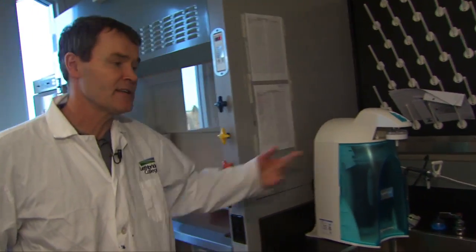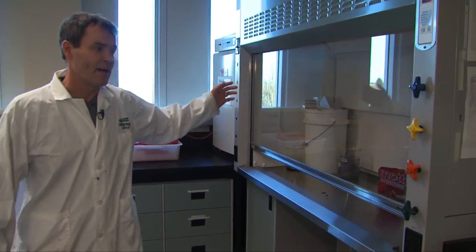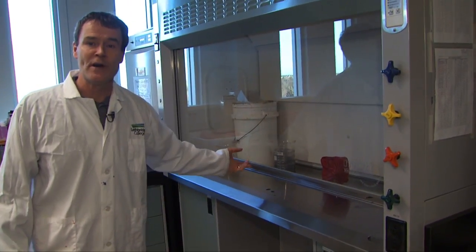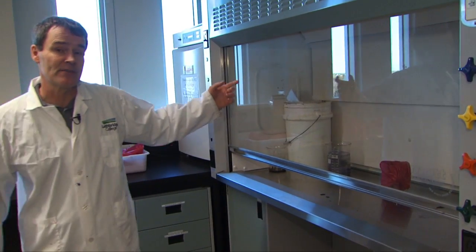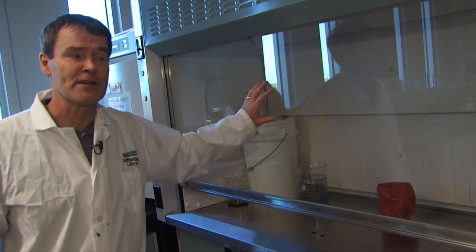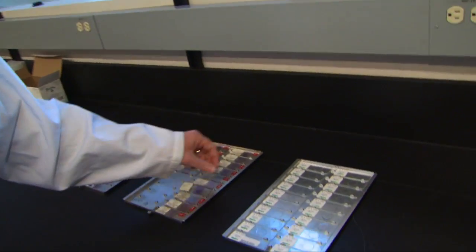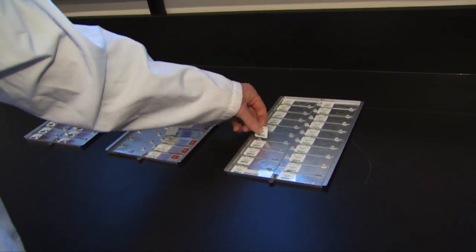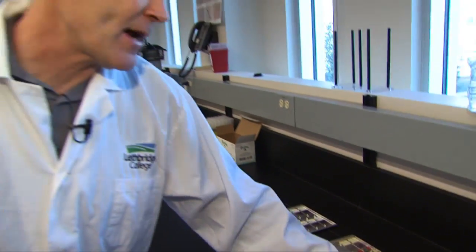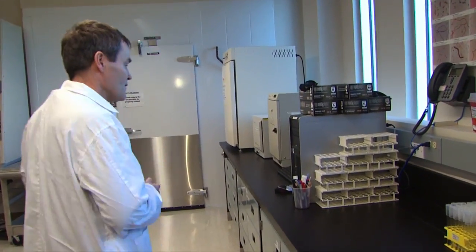You can see we have all our safety features that are required. We have water treatment facilities in all the labs that help to ensure that you get good cultures. We have a fume hood to protect you. Once in a while we'll do some staining steps that are in a heated environment, so you'll need some protection. Right here you'll see some slides — we do some testing, so this is bacterial type smears showing you all the different shapes and sizes of bacteria.